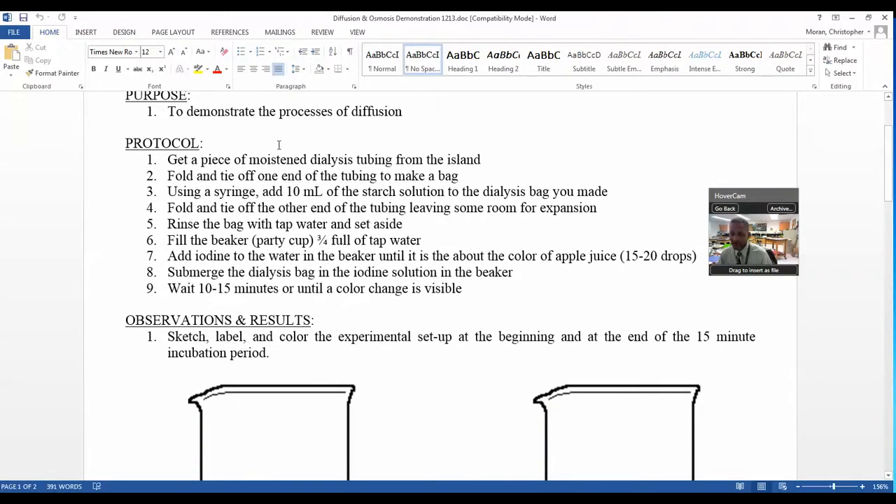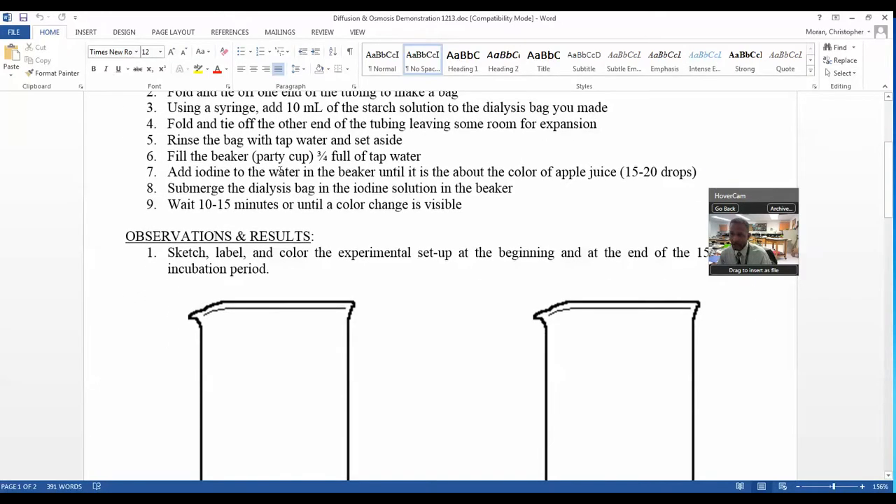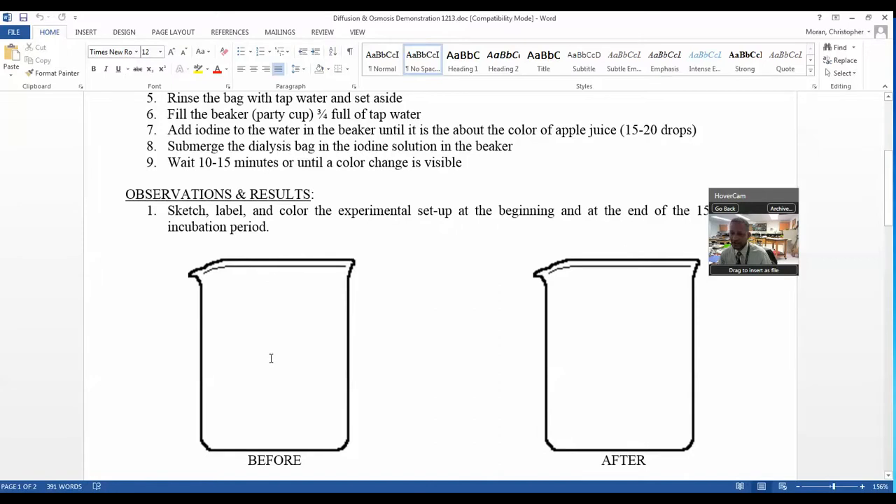We have dialysis tubing, and what we did is we placed starch and glucose in a dialysis bag, placed it in before, and added iodine, and watched to see what happened. What you're going to see next is the directions for the students, and then there's a follow-up video that goes over the results.